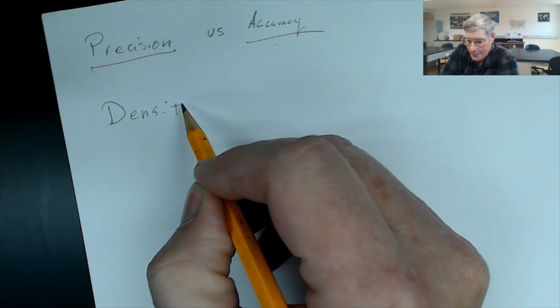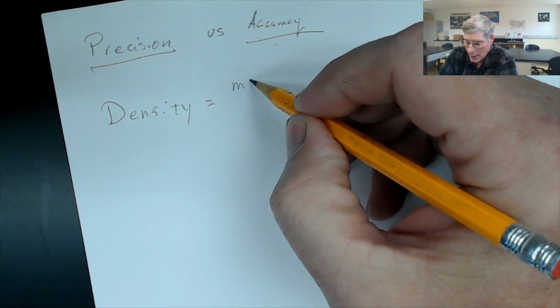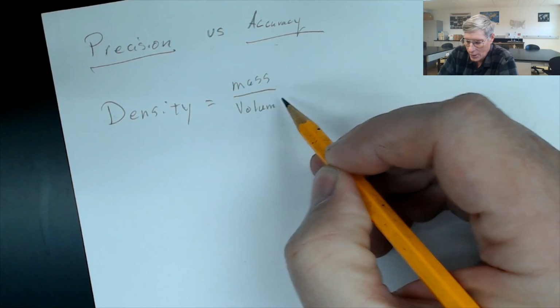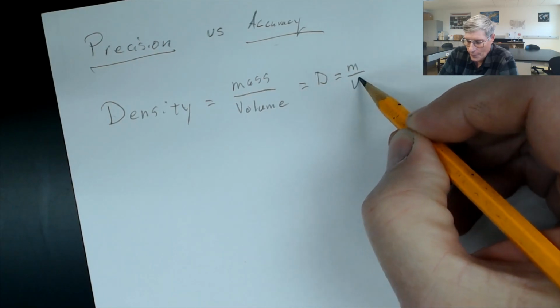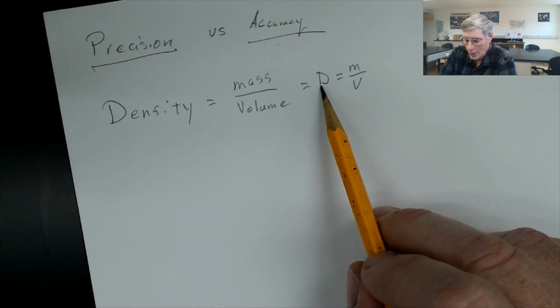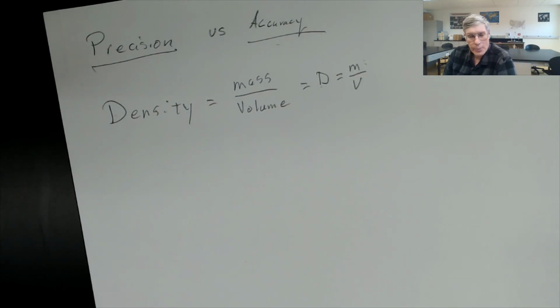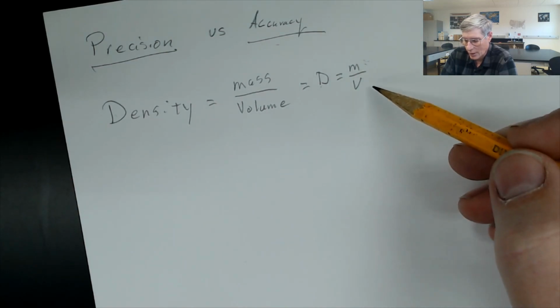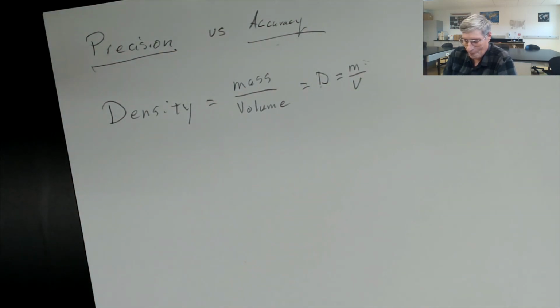What is density? Well, you should already know and have covered it in lecture. The density is the mass of an object versus the volume of said object. And so simply put, we say density is m over v. So we do not have any method for directly recording density, but we do have methods for recording both mass and volume. And so in the 4 parts of today's lab, we'll go through techniques of collecting data for mass and also collecting data for volumes, many of which will have to be calculated.